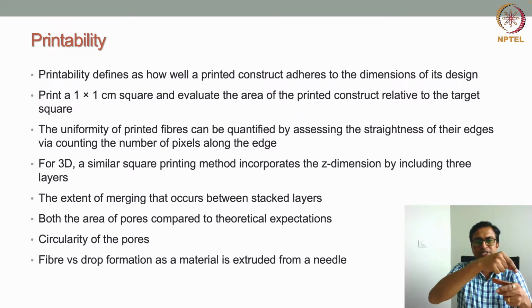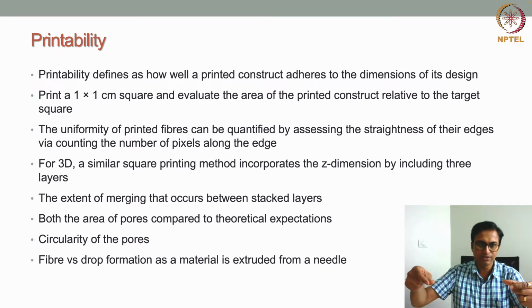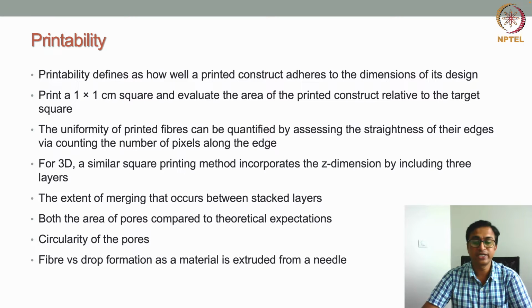Also, if we print a line through extrusion-based bioprinting, whether the printed fiber is straight or not can be decided by the uniformity of the printed fibers, which can be quantified by the straightness of their edges.